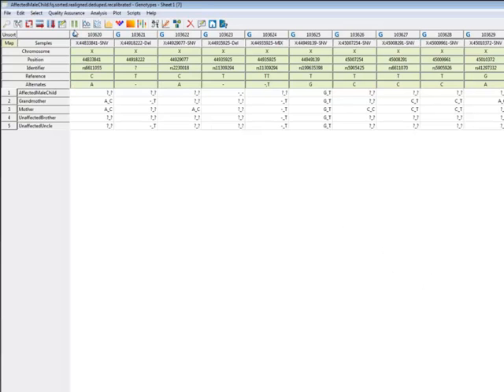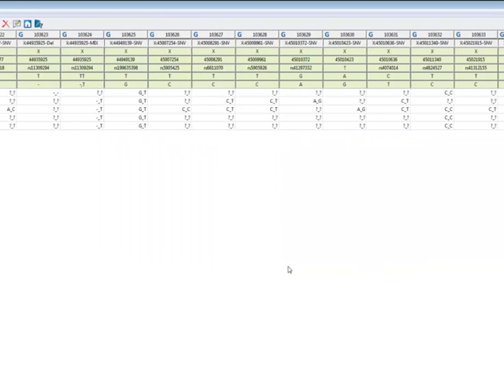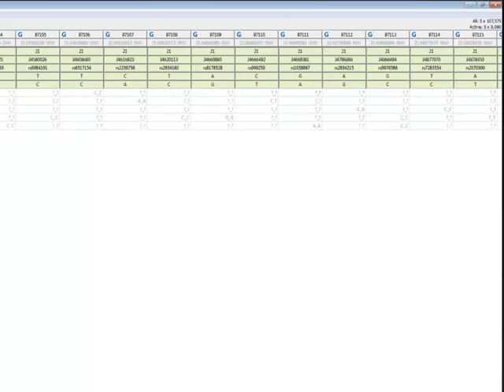So the first thing we'll do is just turn off everything but the X chromosome and say, from here on out in this analysis, I only care about X. And you'll notice up here in the corner, it tells me a lot of columns just got turned off. And what that means, if you come over here into the autosomes, we see this gray text just indicates that that data has been filtered out and we're not going to use it anymore.